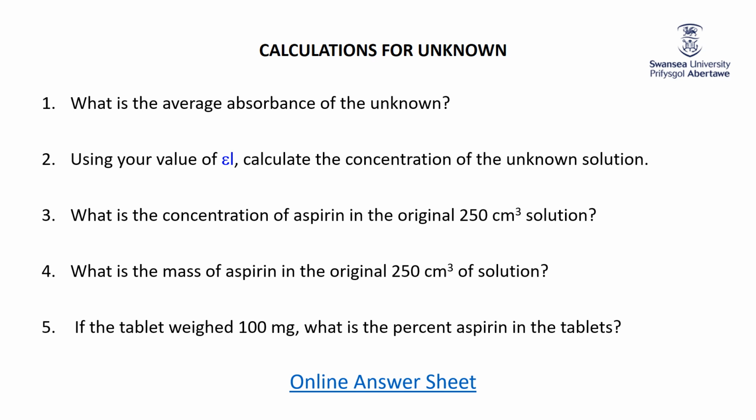So a little bit more complicated. Hopefully you followed it, because what we did here is what people do around the world in pharmaceutical labs or generally analytical chemistry labs, using spectroscopy to determine how much of a particular substance you have.